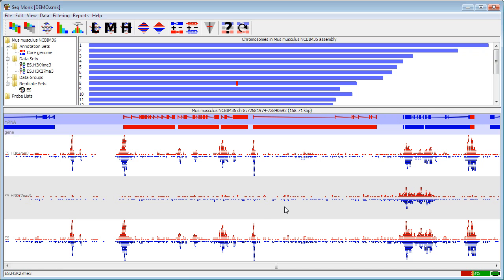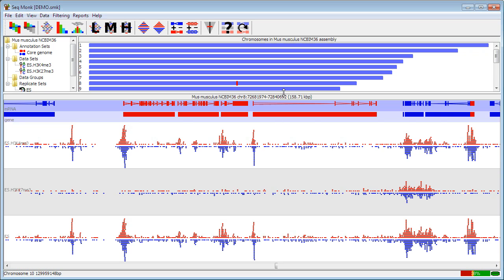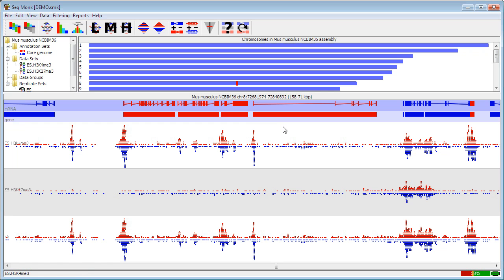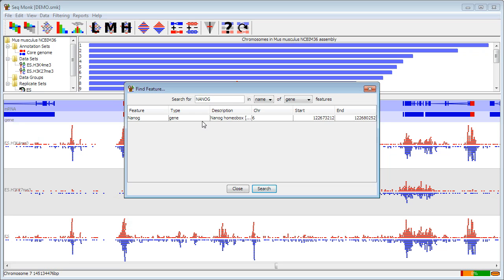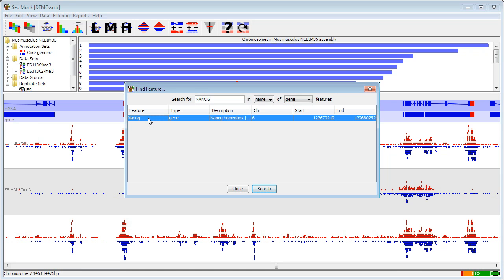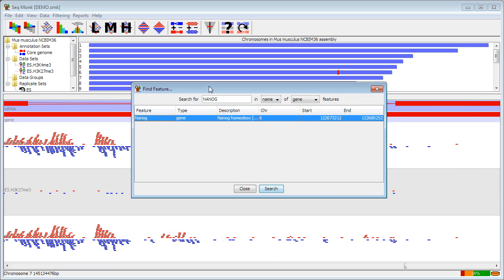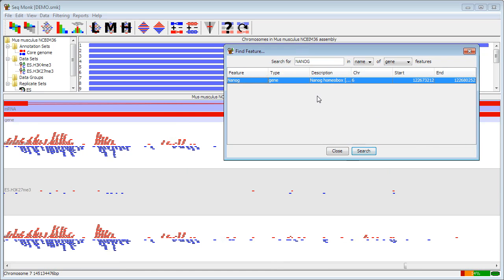If you want to move around your display within SeekMonk in a more structured fashion, you can also search for particular features. To search for features you use this question mark icon in the toolbar which is find feature. The default is to search for gene names. So you can put in your favorite gene and it should hopefully find that. And if you double click on the line it will take you to it. So I can see my gene there.